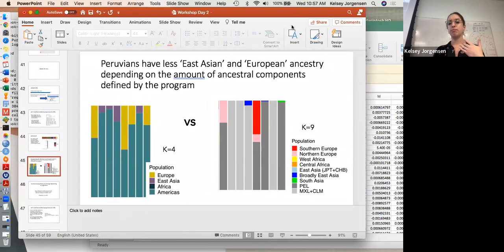But taken overall, you can see that the ancestral proportions do shift depending on how many components you tell the program to run. And it's the exact same way in Structure, right? The other program I mentioned. So in particular for my individuals, you can see that the European ancestry for these 2 almost completely disappeared, or actually it did completely disappear, right?